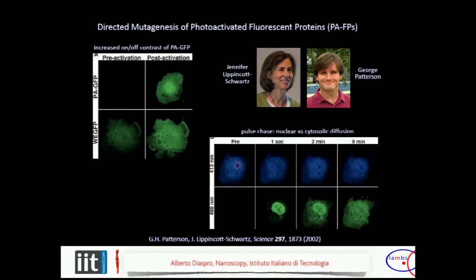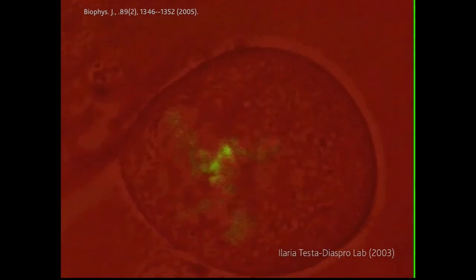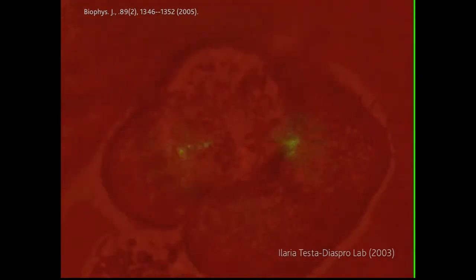But the big jump in terms of advanced fluorescence microscopy was with the advent of photoswitchable fluorescent molecules, green fluorescent proteins. This was the real jump. Both Moerner and Betzig, when they had their own studies on single molecule detection, were in trouble because they were not able to control states. But with photoactivatable molecules, you can control states of the molecules. And if you can control states, you can, for example, switch on some fluorescent molecules in a mother cell.